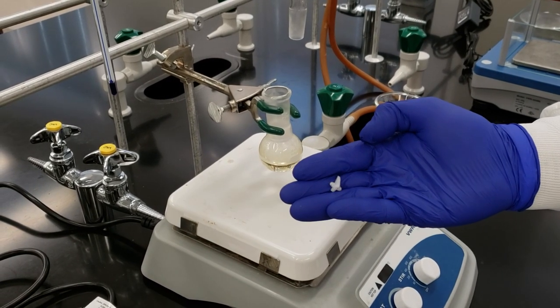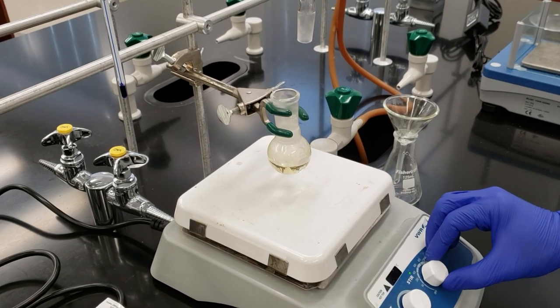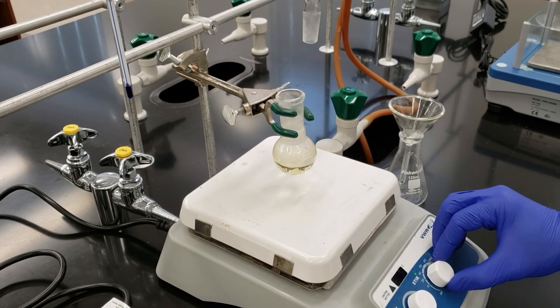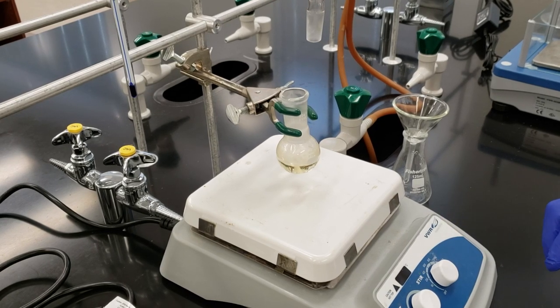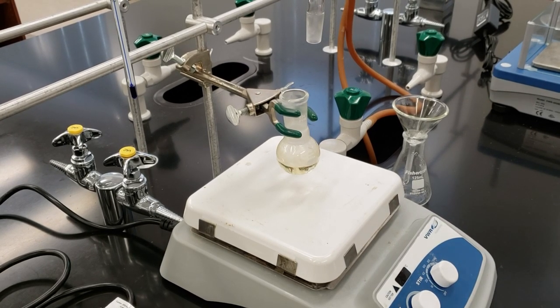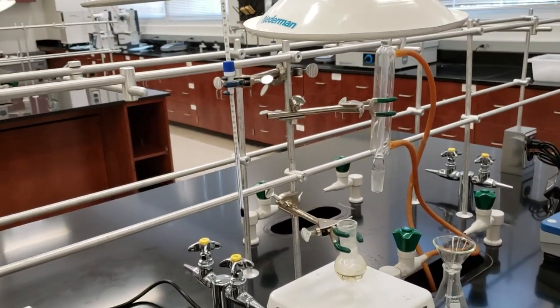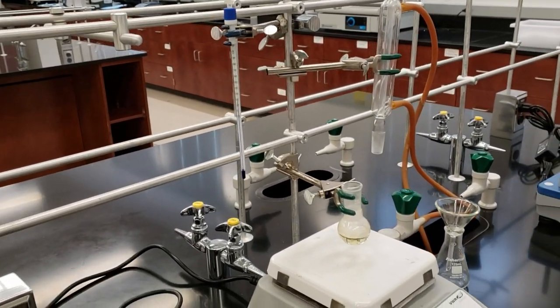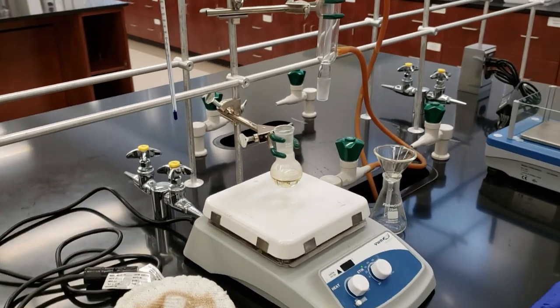We'll add our spin vane. We'll start it stirring just a little bit, just to agitate the solution. And then we're going to let it cool down to 30 degrees. I'll go ahead and move the thermometer into position. We'll wait for it to cool down to 30 degrees, and as long as we don't see any salt precipitation, we'll be ready to move on to the next step, which is adding our tert-butyl alcohol.